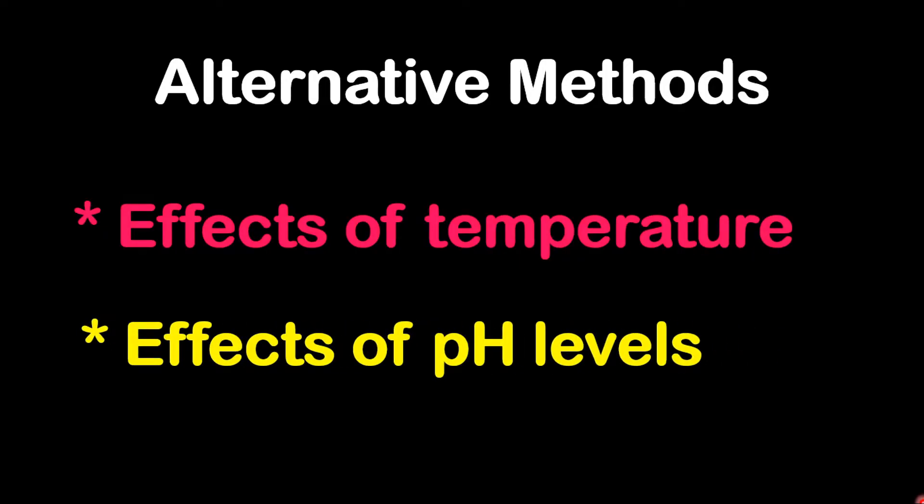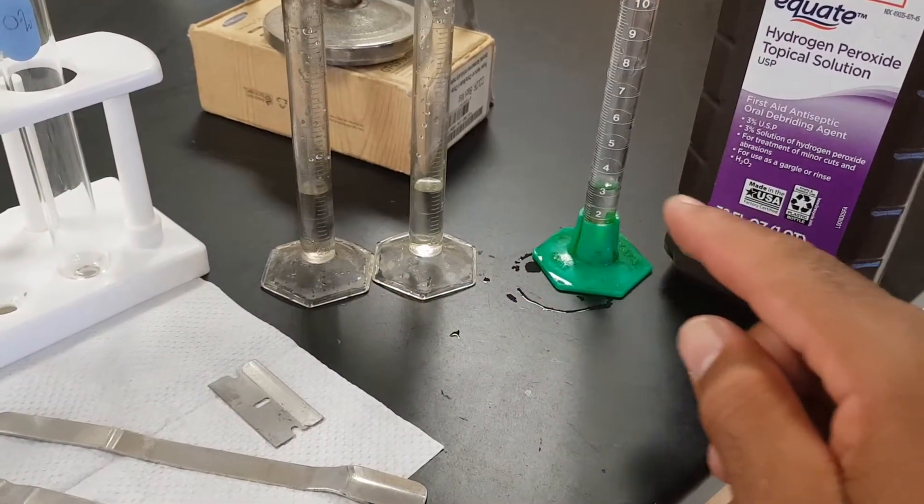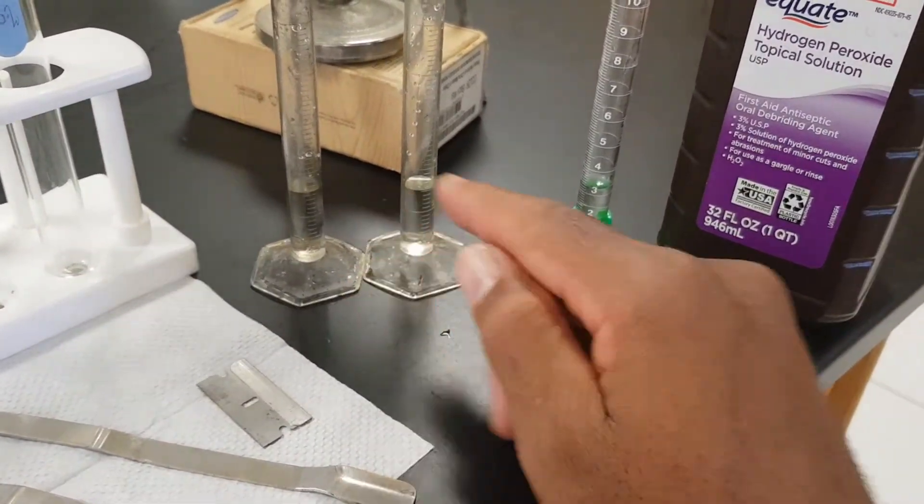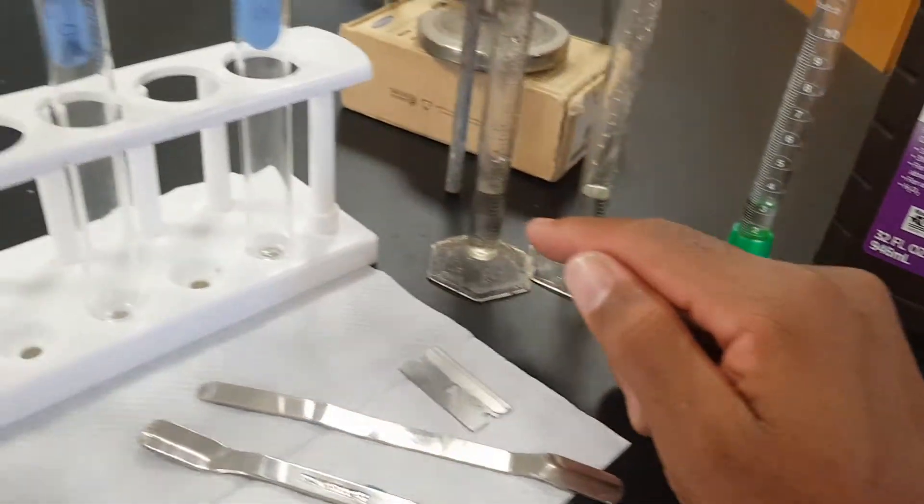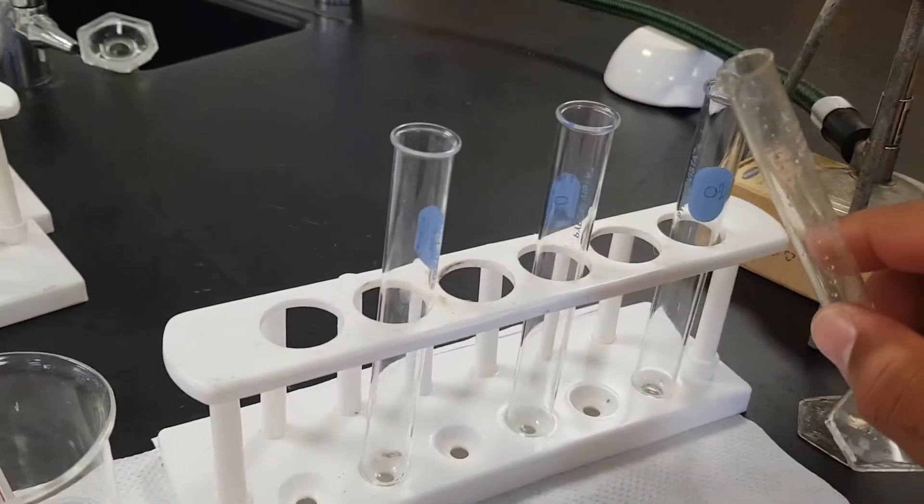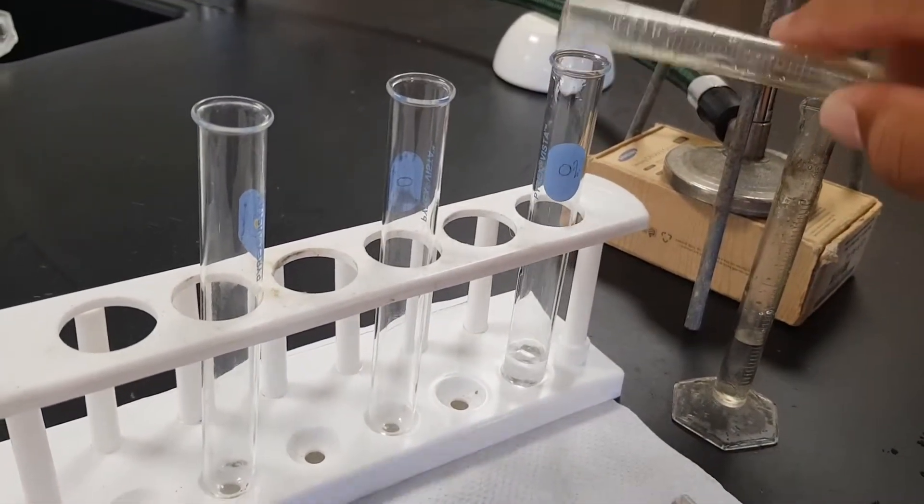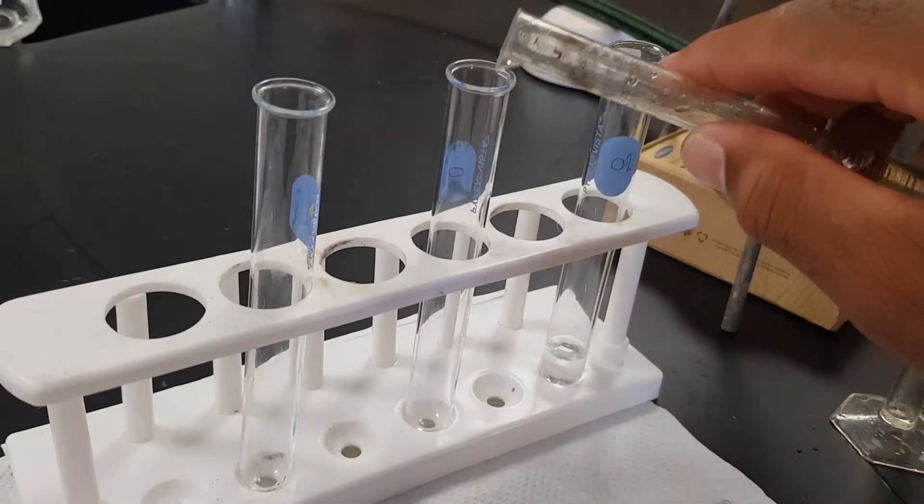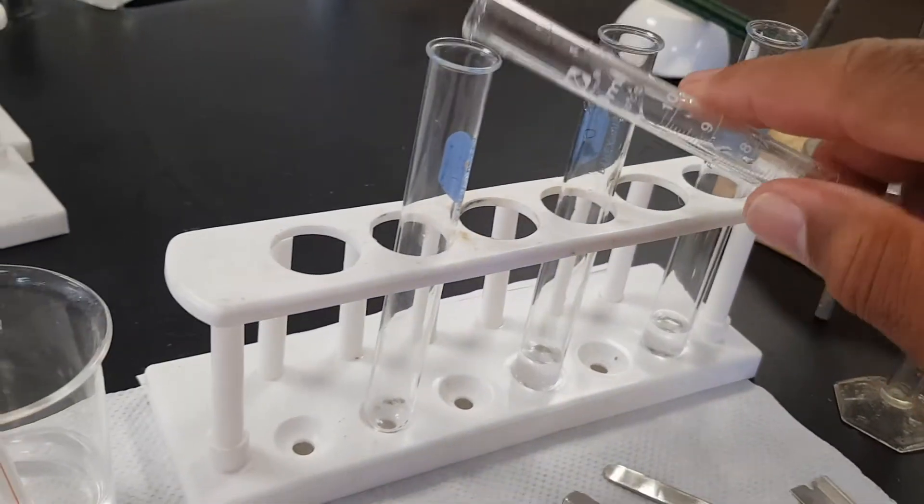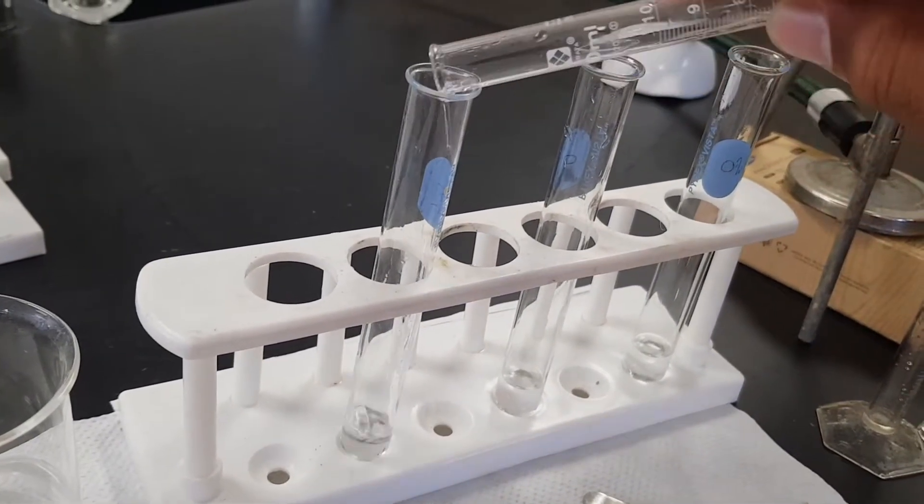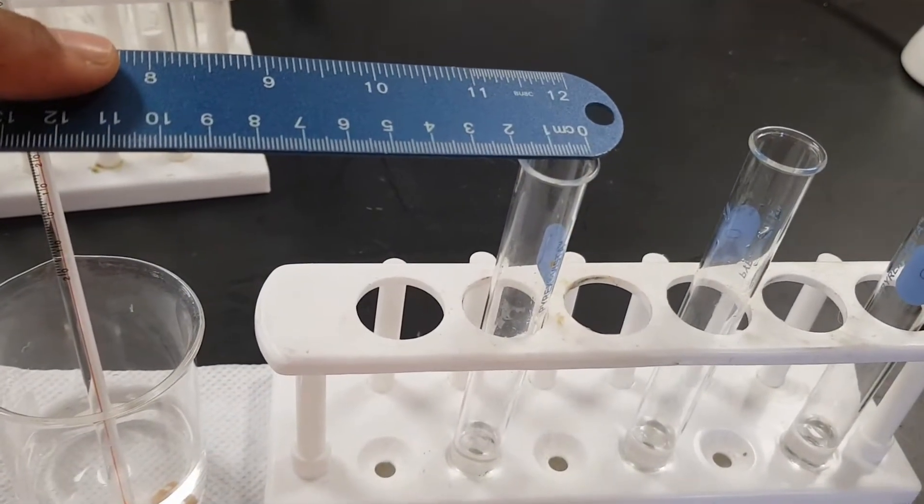Next step you want to do is to pour hydrogen peroxide into three different measuring cylinders at 3 ml. I'm going to pour it into each test tube.